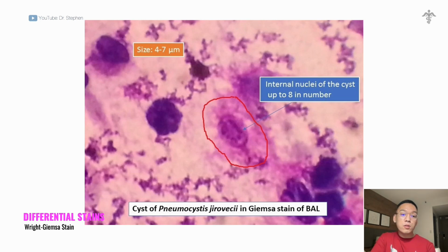This is also known as your polychromatic stain, which contains a mixture of methylene blue, azure B, and eosin Y. The Giemsa stain combines methylene blue and eosin. Eosin ions are negatively charged and stain basic components of cells orange to pink, whereas other dyes will stain acidic cell structures in shades of blue to purple.